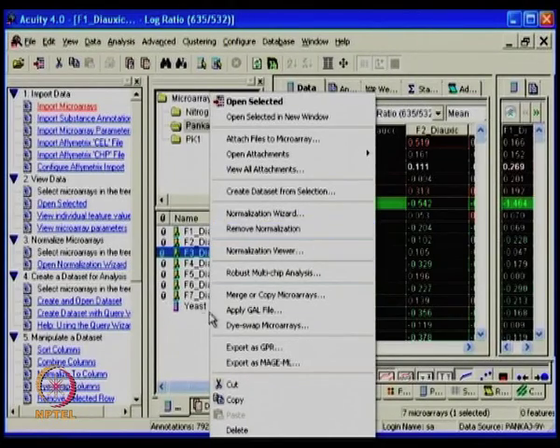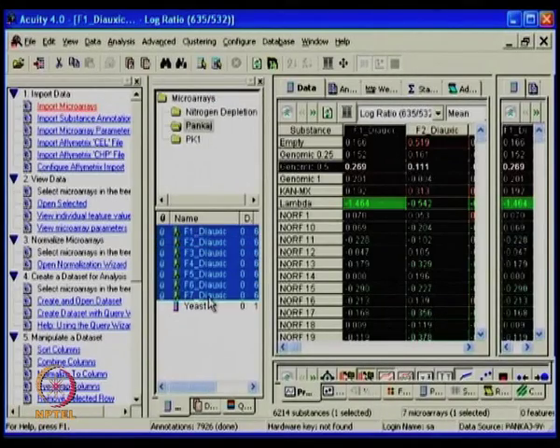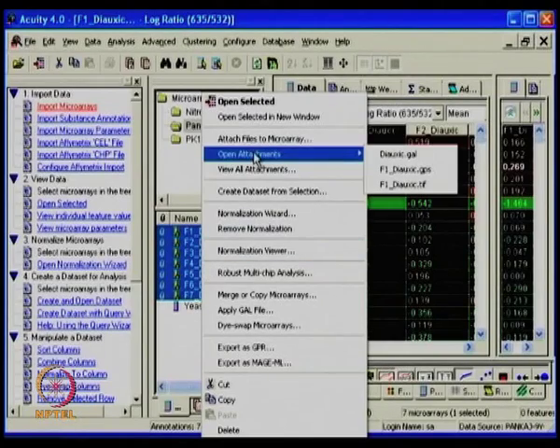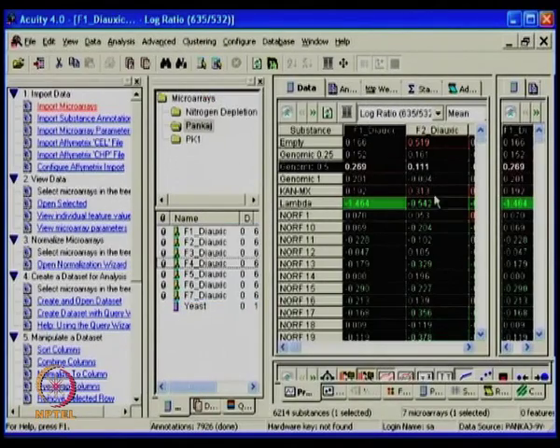You can also select multiple in the similar way, and in one shot you can do normalization in a single go. So this is what I prefer. Usually you don't mess around with different kinds of normalization. Either select all or remove all, because I have imported one to show you how the process is done here. And then immediately one would like to see how my data looks.